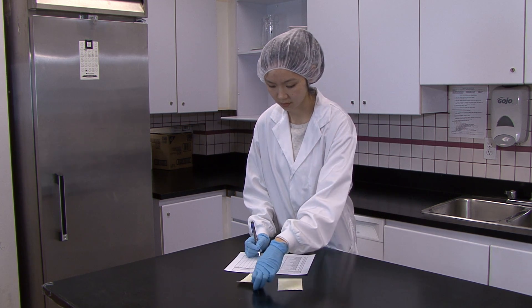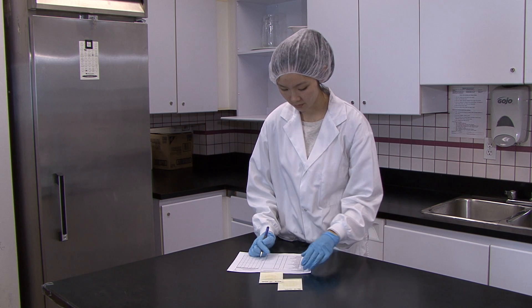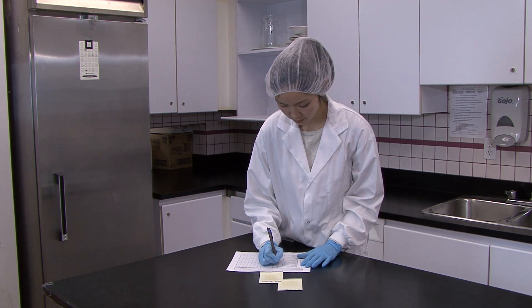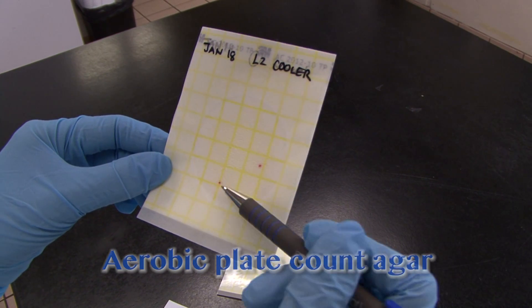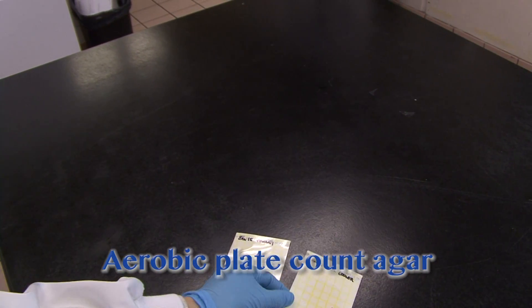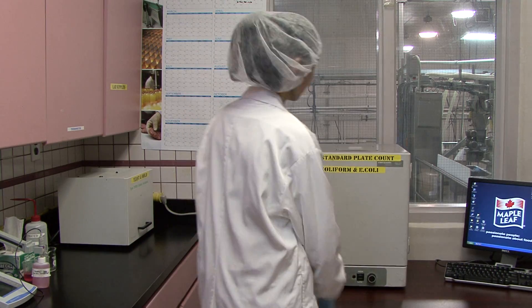For example, for Listeria or for Salmonella, depending on your products — this will help you identify what's causing the problem. Otherwise, stick to a wide-spectrum growth media such as aerobic plate count agar, which is most commonly used. While this method is easy to do, the downside is that it takes 24 to 48 hours to culture your films or plates and get the results.